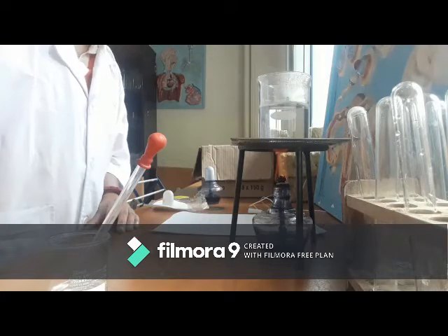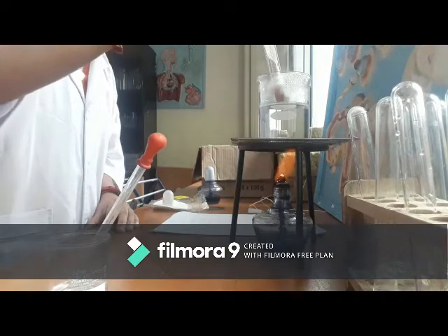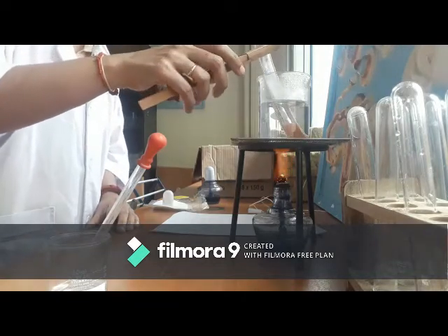So look at the changed color. It turns to brick red, which proves that it contains reducing sugar.